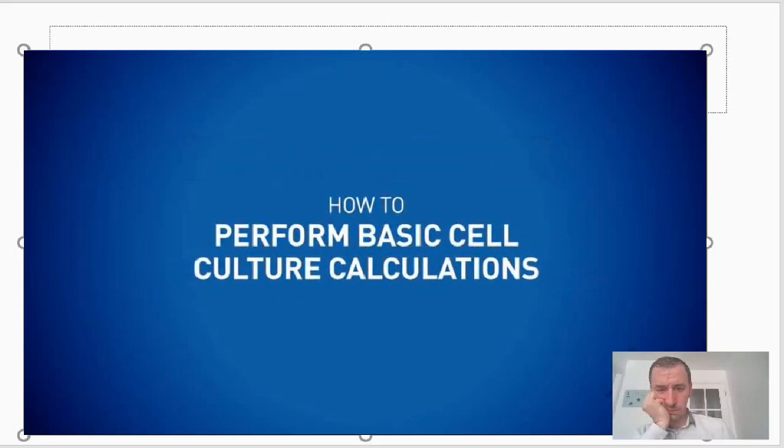The hemocytometer and these equations helped us determine cell density and viability. Based on this, you can also create growth curves or calculate the best window for cell passaging. You'll find more information on how to perform these basic cell culture calculations in a separate video.